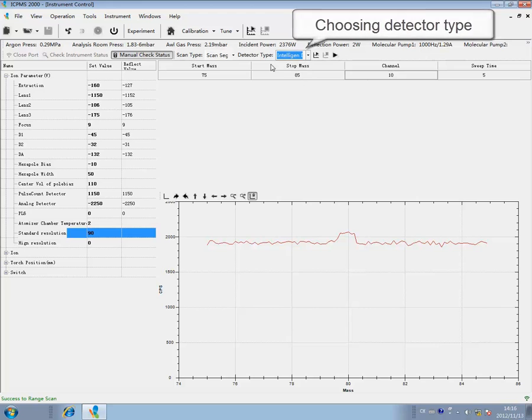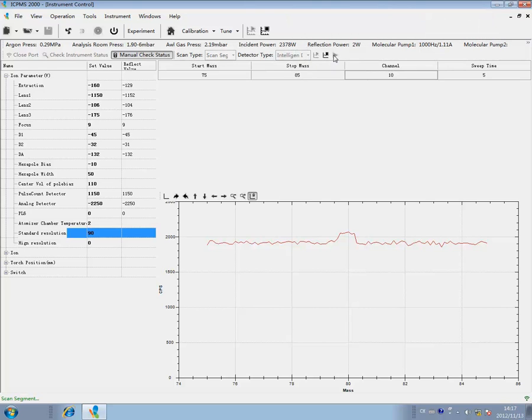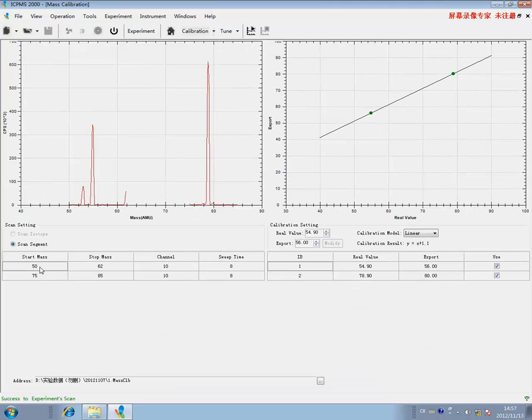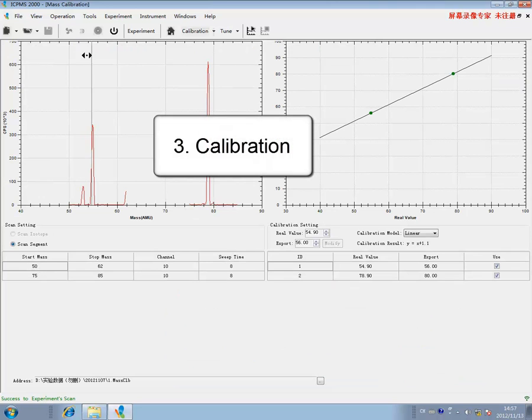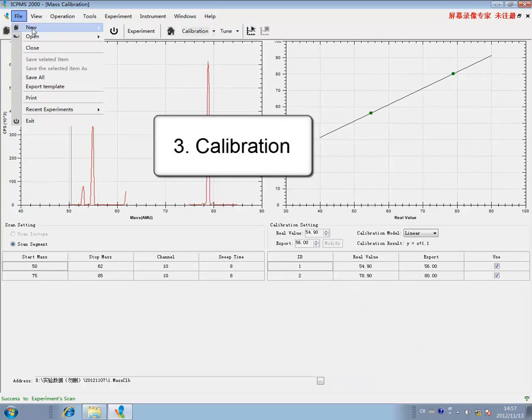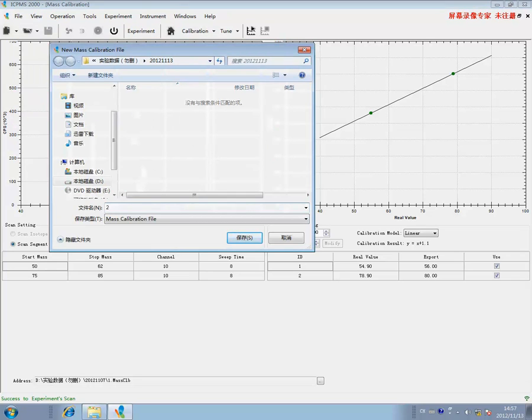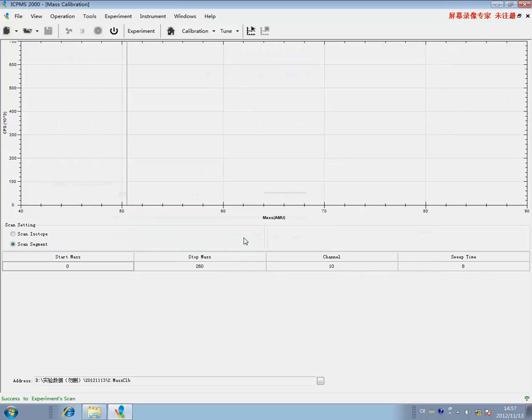For instance, we can scan from 75 to 85. Click the Scan button to start scanning. A peak is displayed. If the peak is deviated, we shall carry out mass axis calibration.